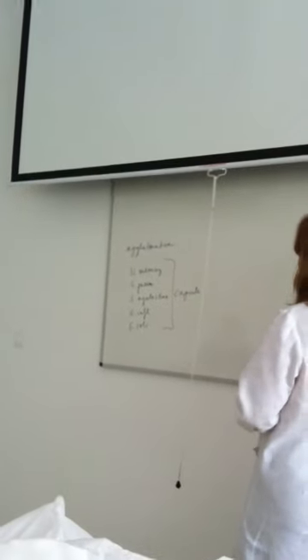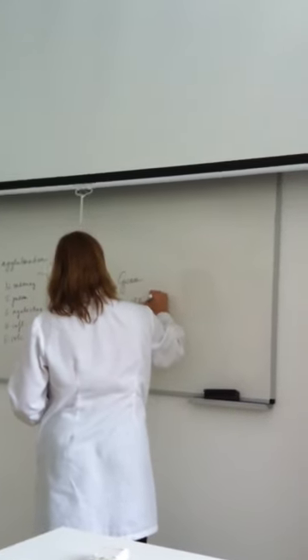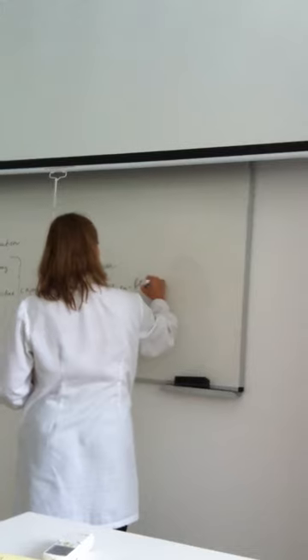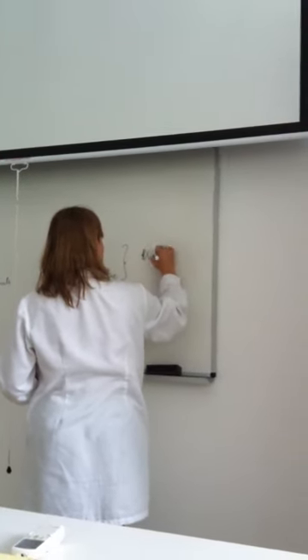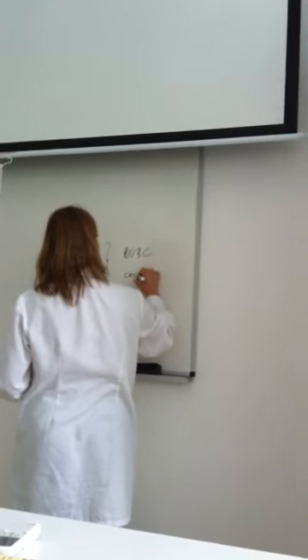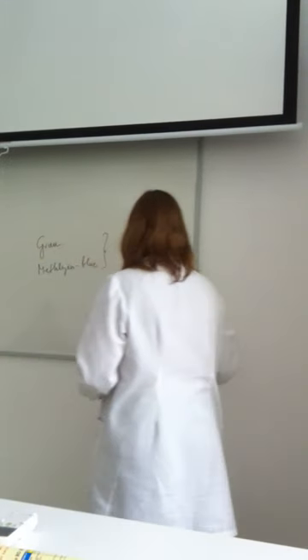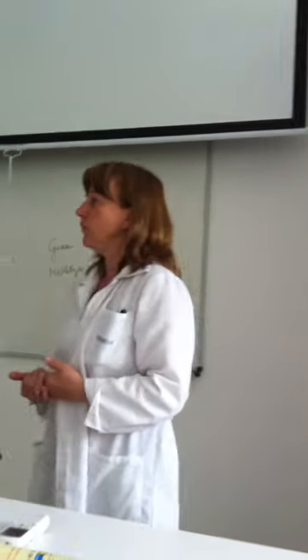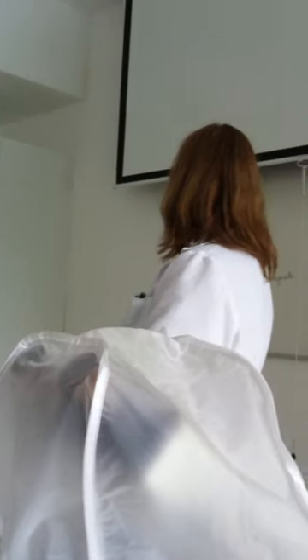From the sediment, we can make a Gram stain and the methylene blue preparation, and after it, we can see is there any white blood cells, or what about the coccus or rod, Gram positive, Gram negative, so we can inform the clinicians before culture. So we can tell if we have a positive agglutination test.